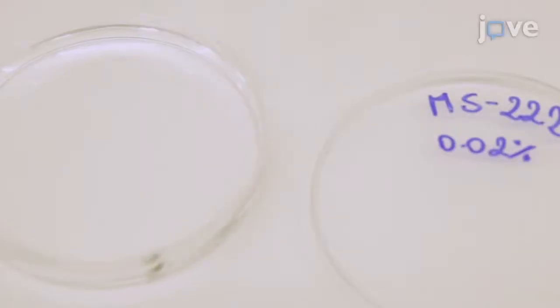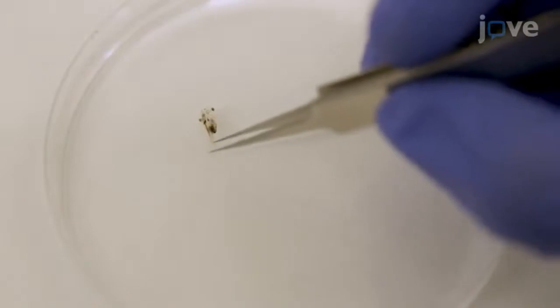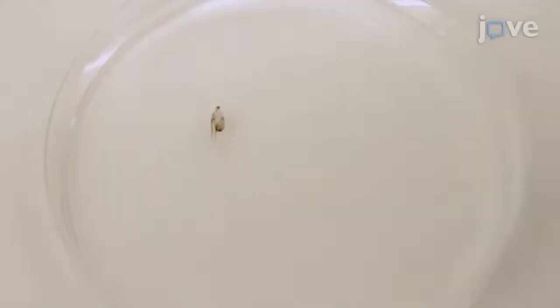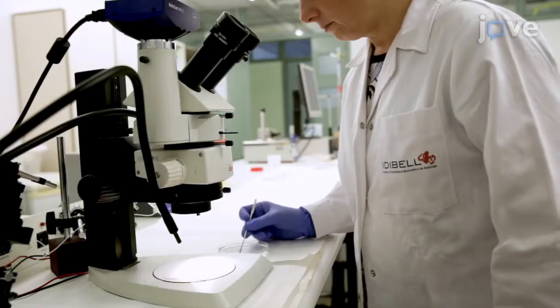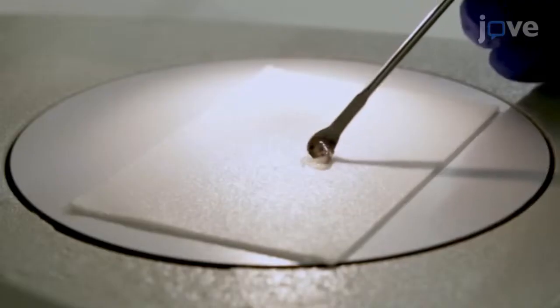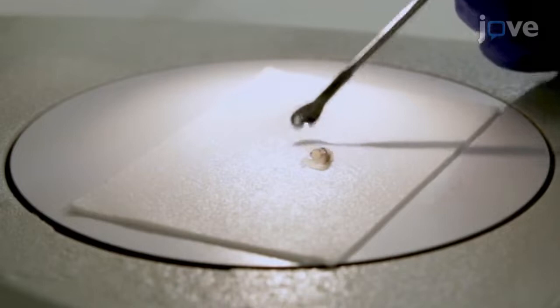Check for proper anesthetization by the absence of a reaction to mechanical stimuli applied at the tail level using tweezers. Place the anesthetized tadpole on the filter paper under the scope. Position the animal with its dorsal side facing upward so brain structures can be visualized.